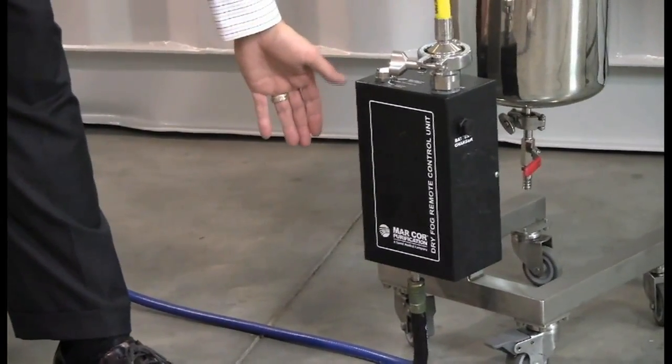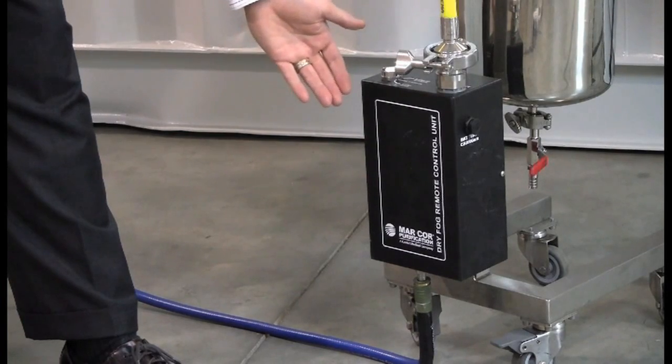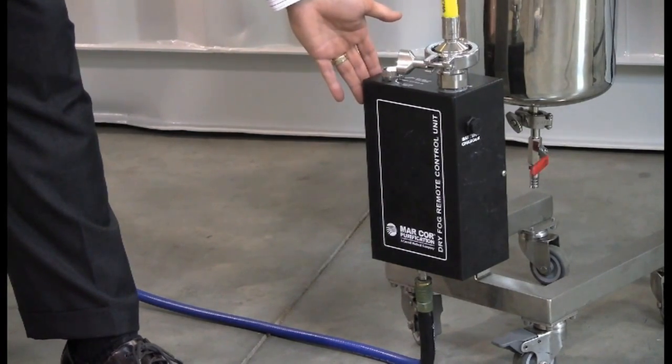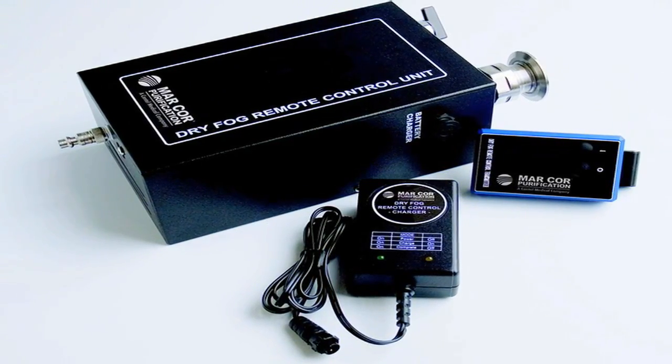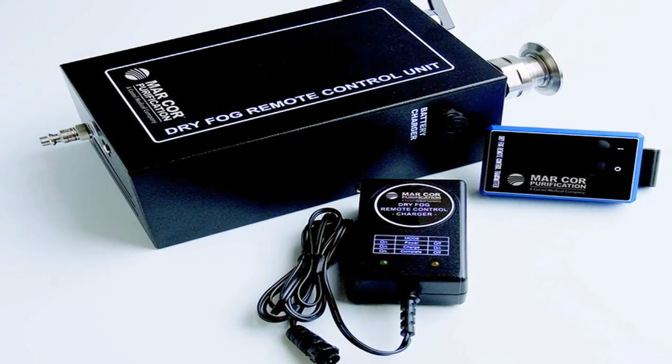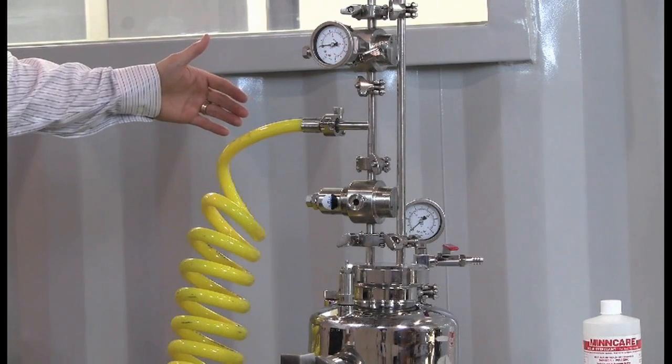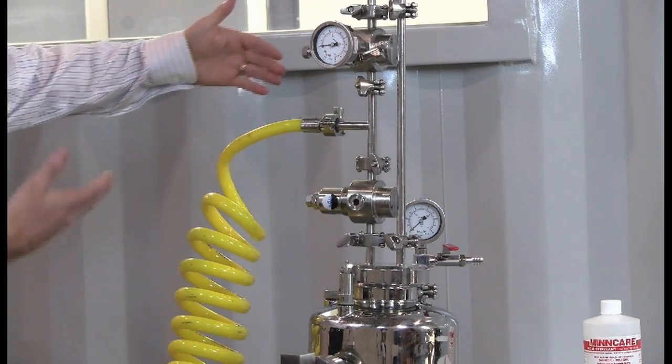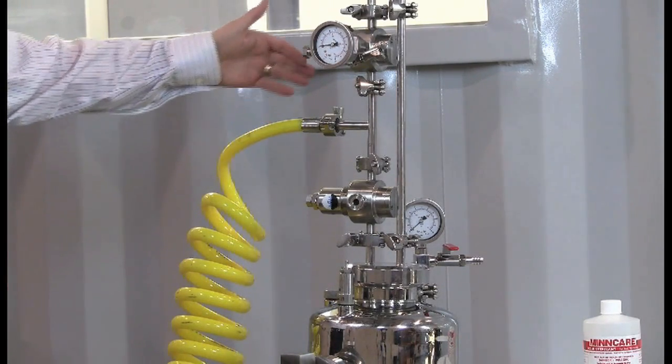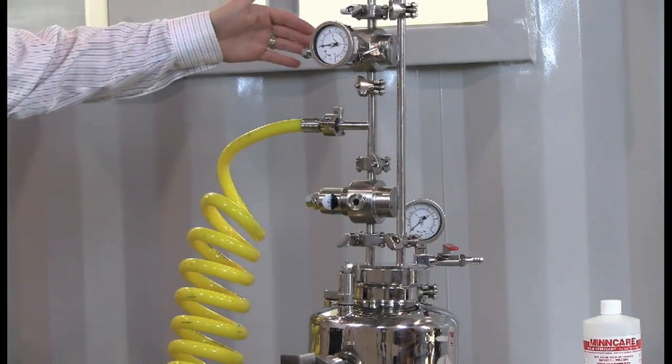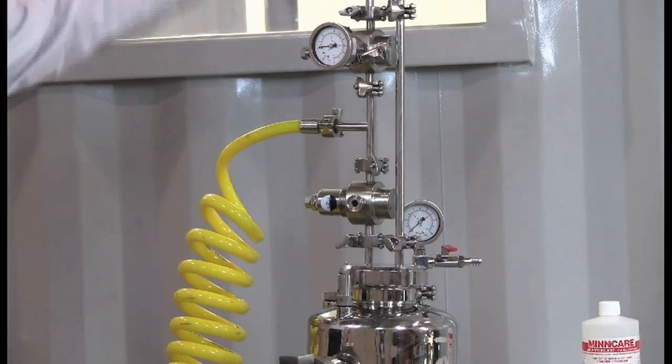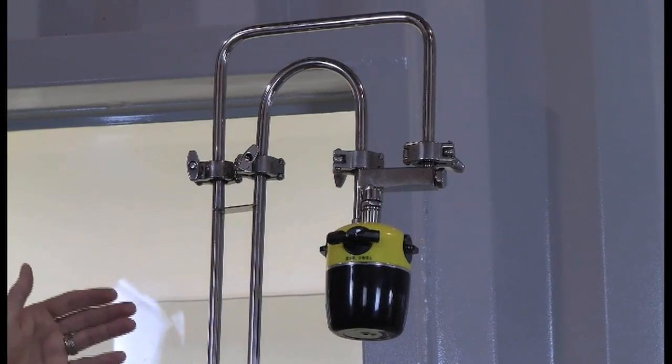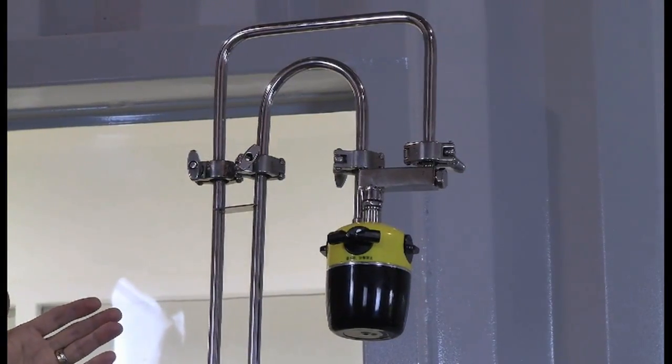To describe all the components of the unit: compressed air comes in the bottom of the dry fog remote. The dry fog remote turns on and off with this remote control when you're outside the clean room, allowing you to operate it and not be in the clean area. Compressed air connection to the dry fog unit. Pressure gauges and regulators regulating the compressed air to the tank as well as to the head. This is the dry fog head, the heart of the dry fog machine.